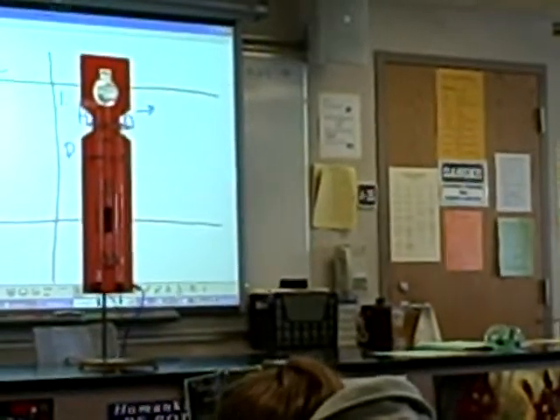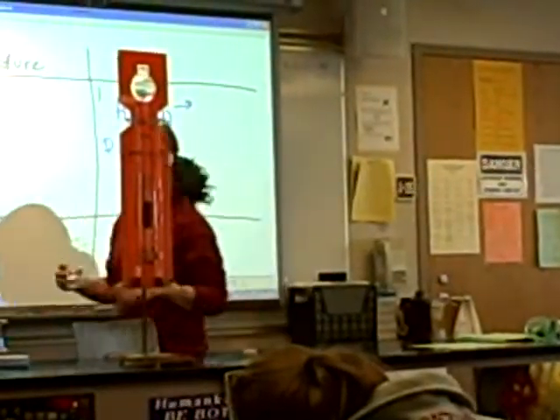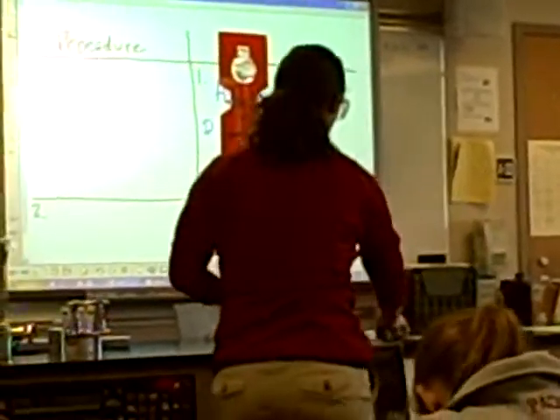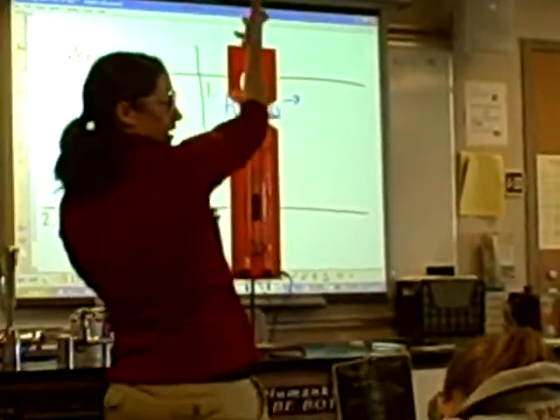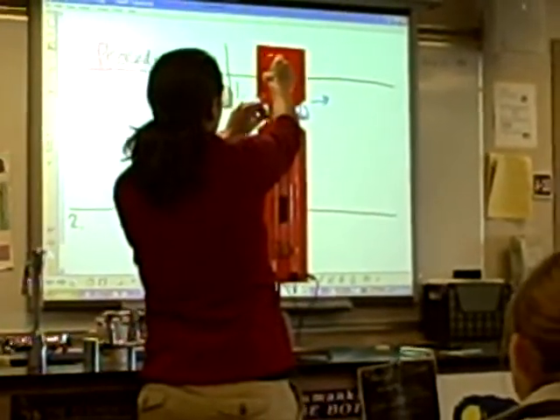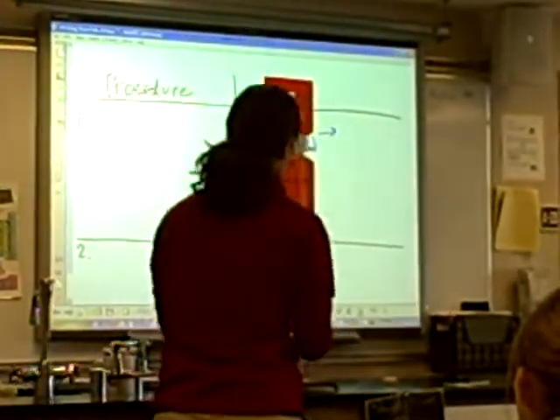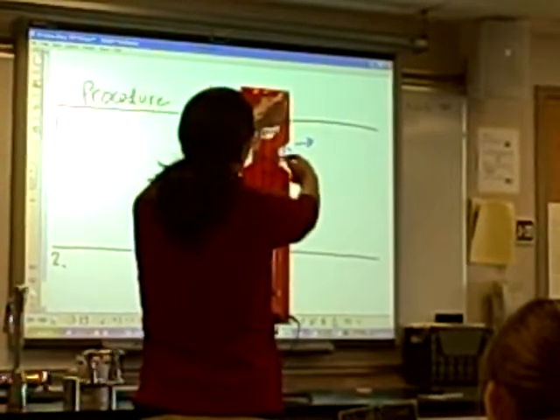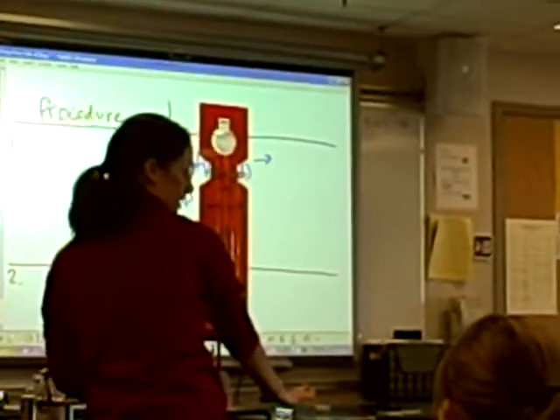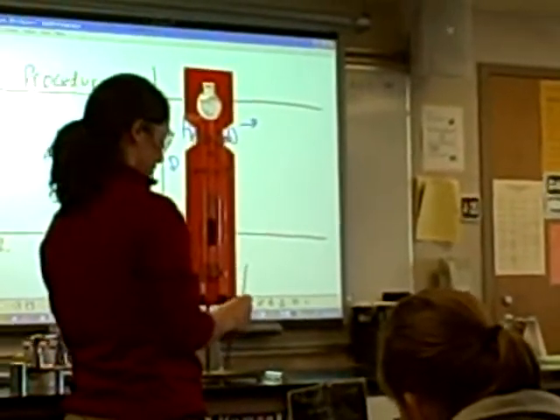Alright, so I'm going to collect it in test tubes. We're going to do the test, and someone's going to have to come hold them and help me out again. So, the way I collect them, if I open the top up, gas is less dense. It's going to escape up. It's going to push any gas that's in here out. Okay, so this we're predicting is hydrogen. Or no, oxygen, sorry, and this is our hydrogen. Oh, that's a cool sound. Okay, so we just have tubes of gas. And let's do hydrogen first, since we've already seen it, so we predict what it's going to be.